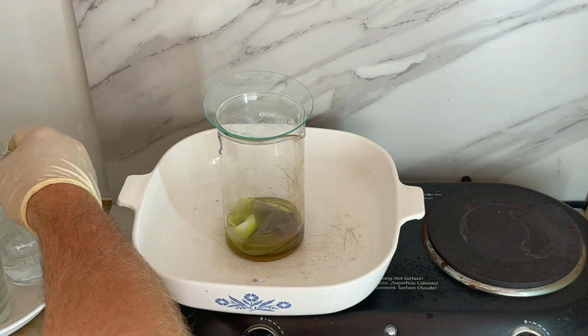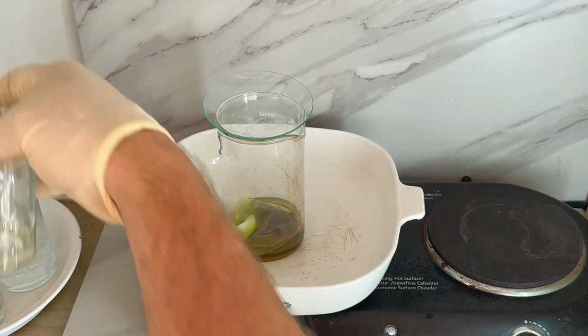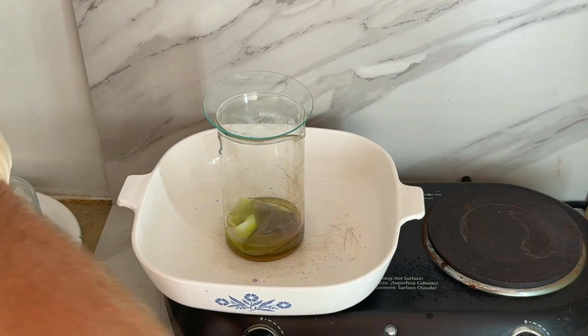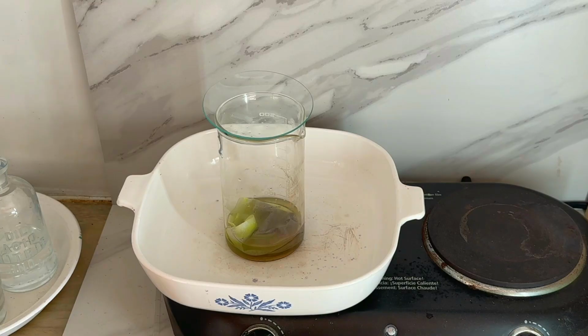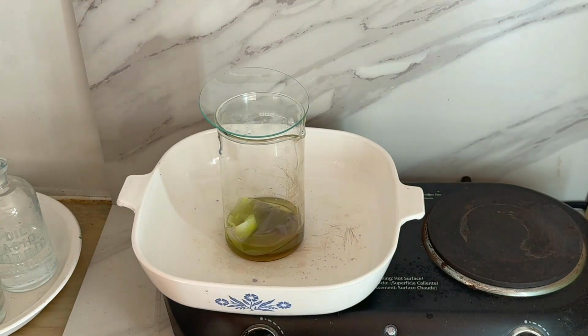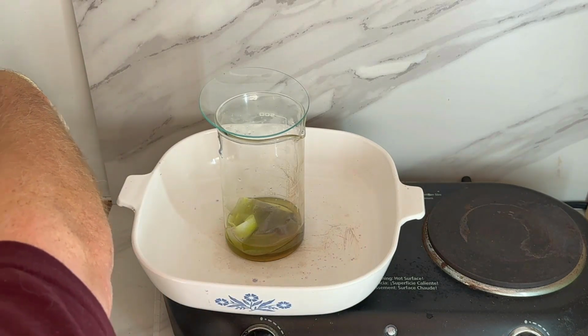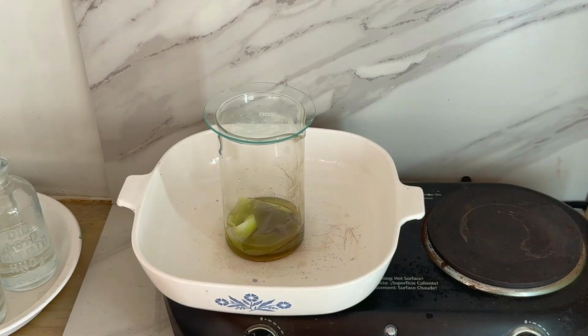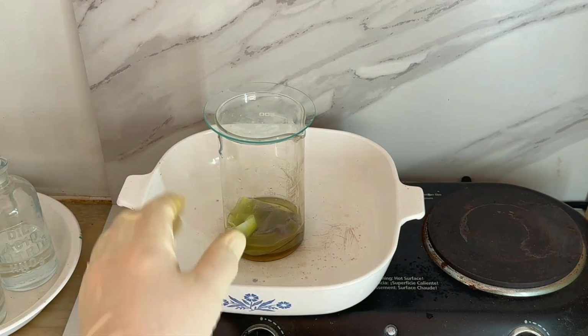Because this was an ugly solution, also going to add a couple of drops of sulfuric acid. This will precipitate out any lead when we do our filtering, so we can remove anything like that that might have made its way through to this point. Okay, we'll adjust that cover here, get it back on tight. Leave this on the heat, let the aqua regia do its thing.